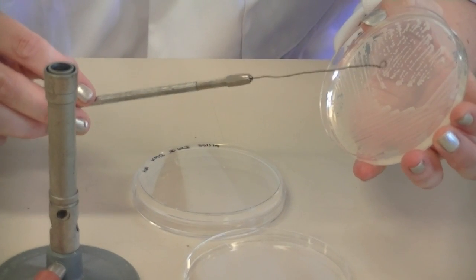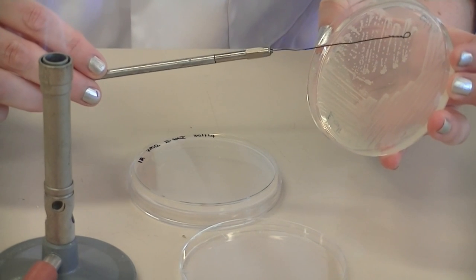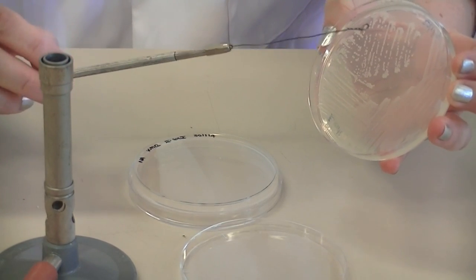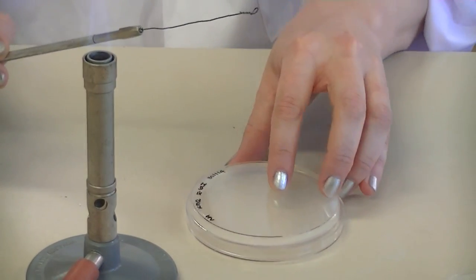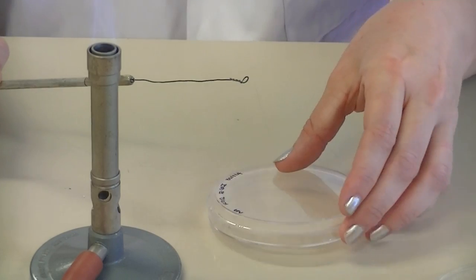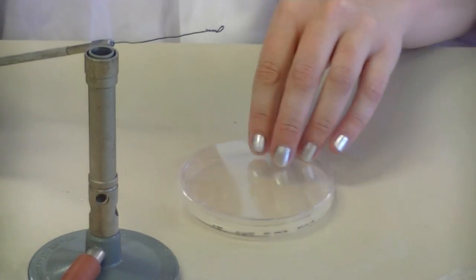It didn't sizzle, so it's ready to be used. Collect a single colony from this plate and transfer it onto your new sterile agar plate. Remember, when you labelled your plate it was upside down, so you need to turn it now the right way up.